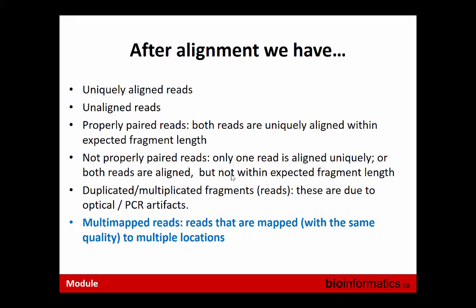We know that mammalian genomes are highly, highly repetitive, like 40% of human and mouse genomes are actually repeats. We call them repeat sequences, not identical, but close enough for short reads to be placed in multiple locations. And those are also problematic, because if we don't know where to place a read, we don't know how to work with it. The aligner, BWA chosen, maybe not the best, but the strategy is also chosen, it arbitrarily assigns one. Out of like 10 locations where the read can be aligned, BWA arbitrarily assigns one location.